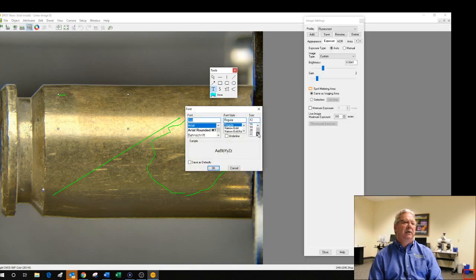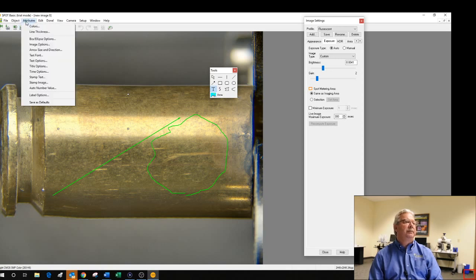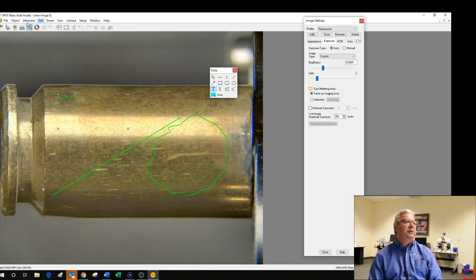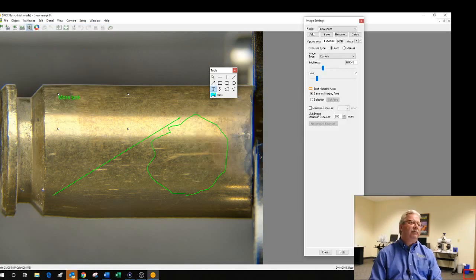And now we can, first of all, make that text larger. Still not large enough. Oops. So we're going to do text font again. It's a little better. I guess I could probably even make it bigger if I wanted to. You can see I put more junk there. If I find that later, I certainly can decide that I probably didn't intend to keep this picture.